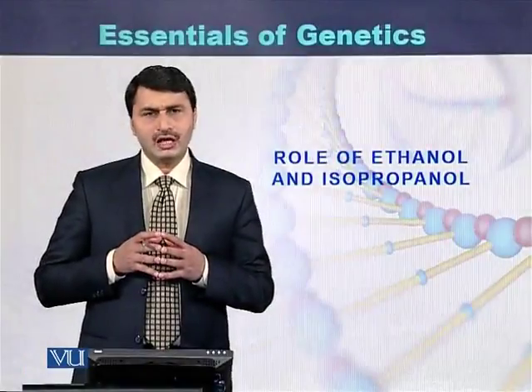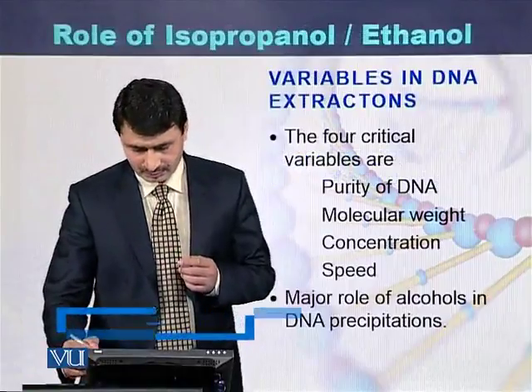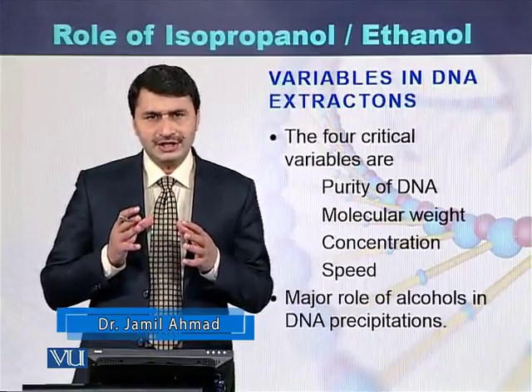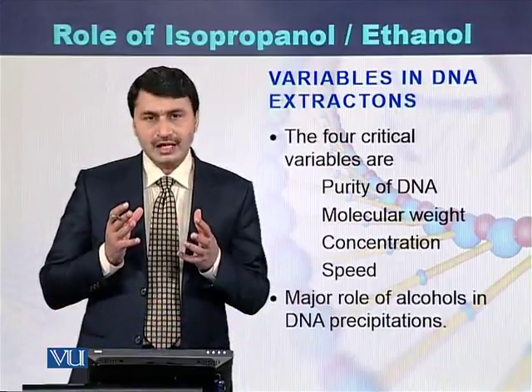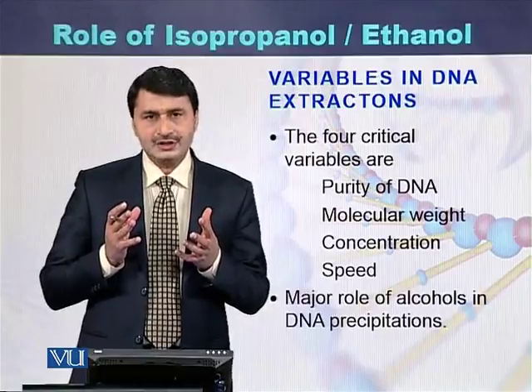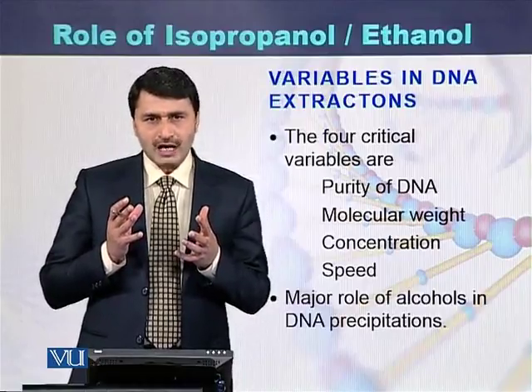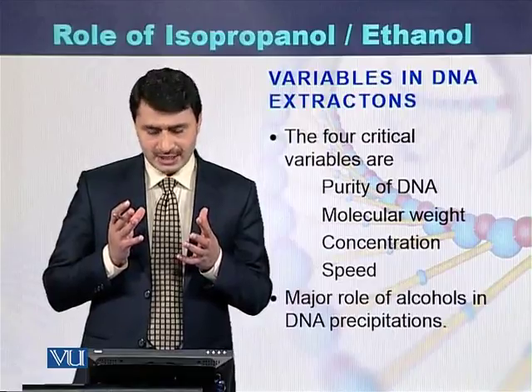Role of ethanol and isopropanol in DNA extraction. There are several variables which should be considered while purifying DNA. Those variables are the purity of the DNA, molecular weight of the DNA, concentration of the DNA, and the speed at which DNA has to be purified. All these factors play a role in purification and good quality extraction of the DNA.